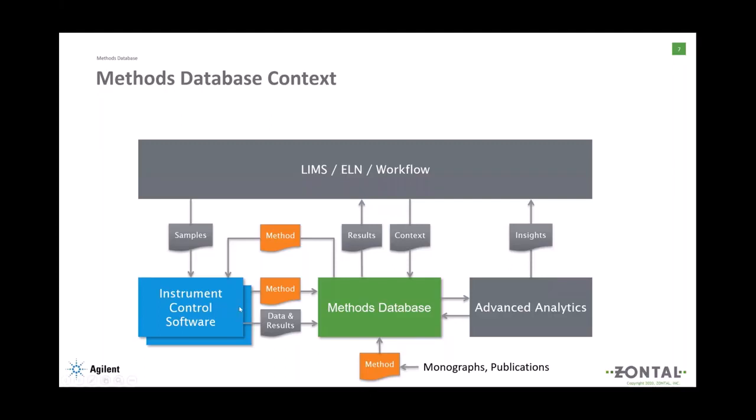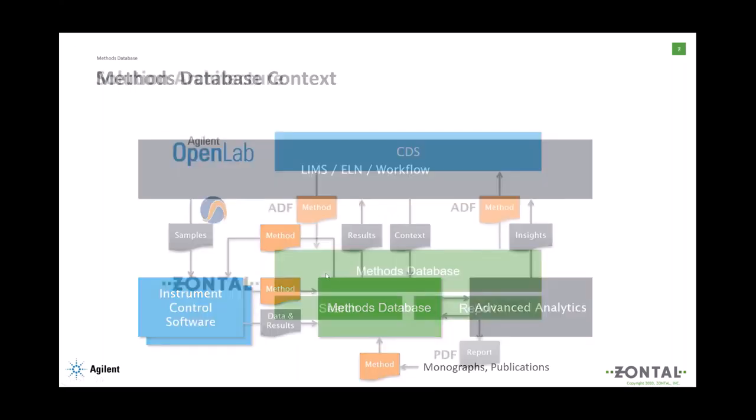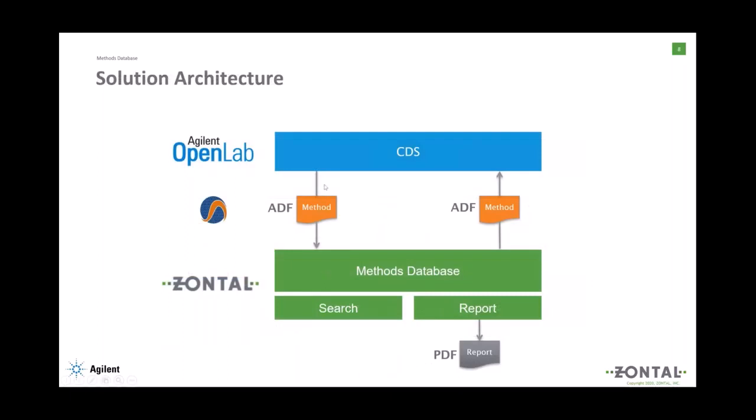So if we zoom into this CDS method database integration, then we can see that we can upload methods to the database, download methods from the database. Then within the database, we can run the queries on those methods and also then generate the human readable report. So in the live demo, we will show OpenLab from Agilent as the CDS system and ZONTAL as a method database to implement that concept.